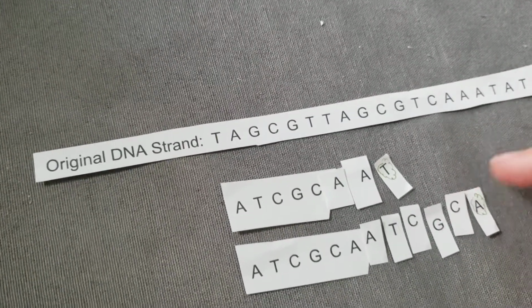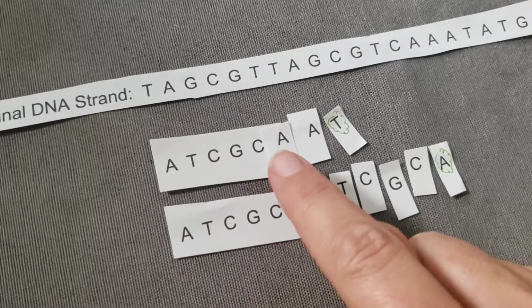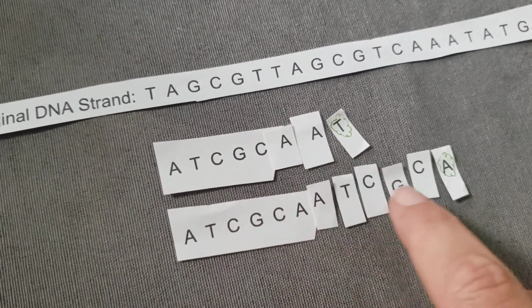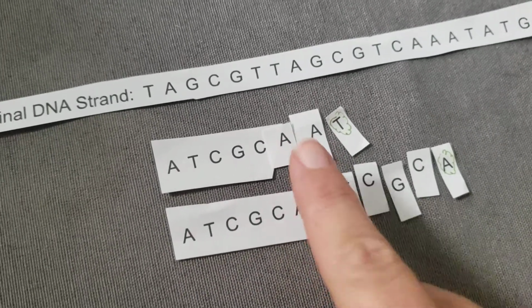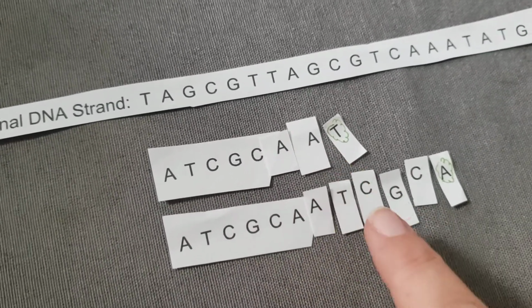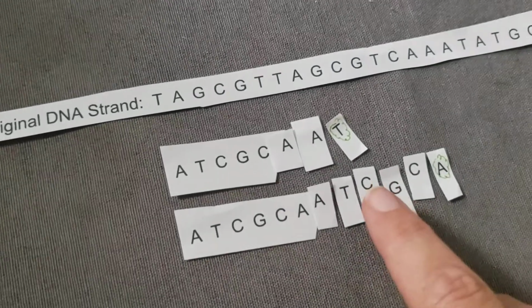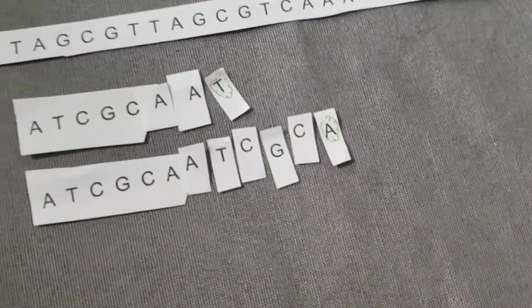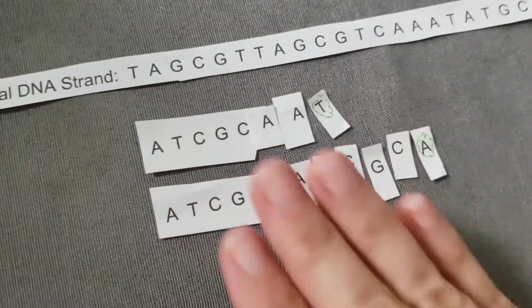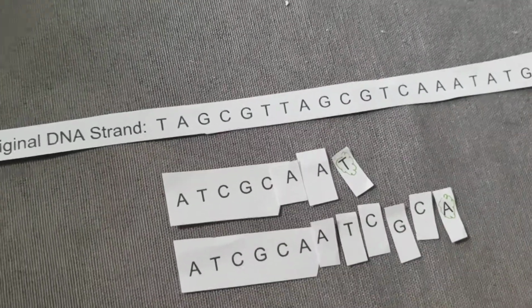So imagine doing this enough times that every single one of the letters from the point of the primer onward at some point is a fluorescent letter. If you did this enough, you would have a fluorescent A at some point, then a fluorescent T at some point, which we already had, then a fluorescent C at some point, a G at some point, a C at some point, and now we have the A, and so on, all the way down the line. So now you have this mixture in your tube of all this stuff, right? What do you do next?